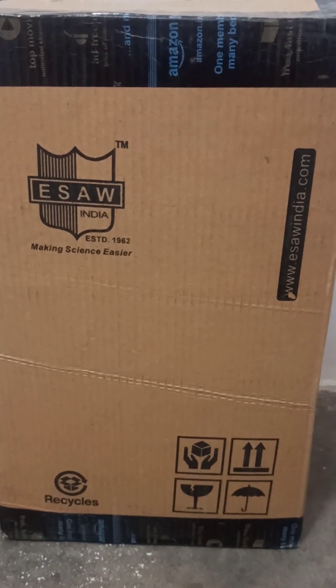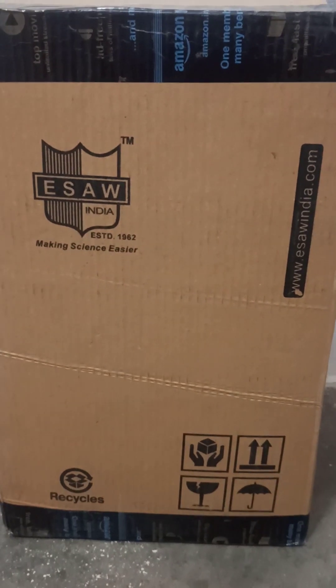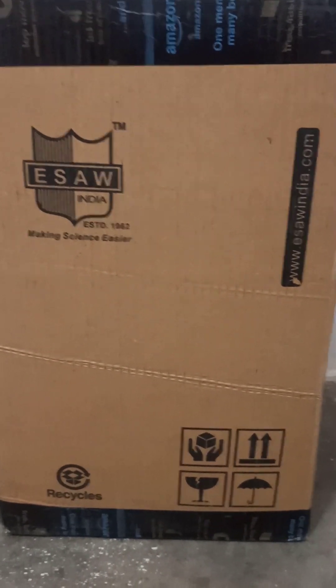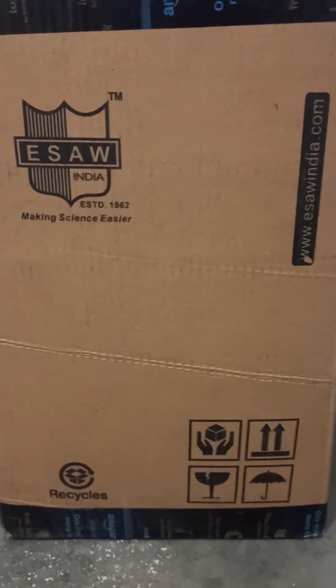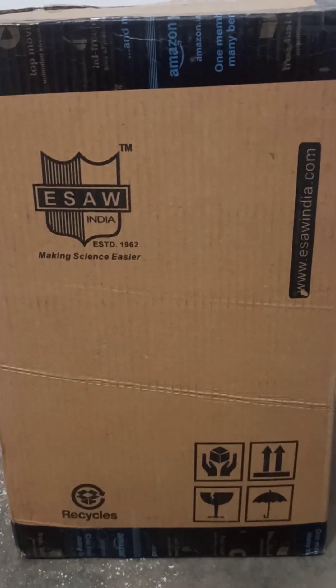Hi everyone, this is an unboxing video for an ESAW microscope that I ordered from Amazon. It just came a few days back, so I opened it, but I will show you how it came.